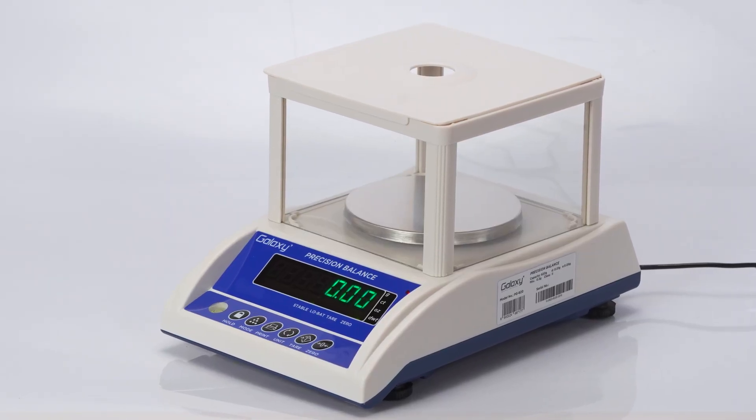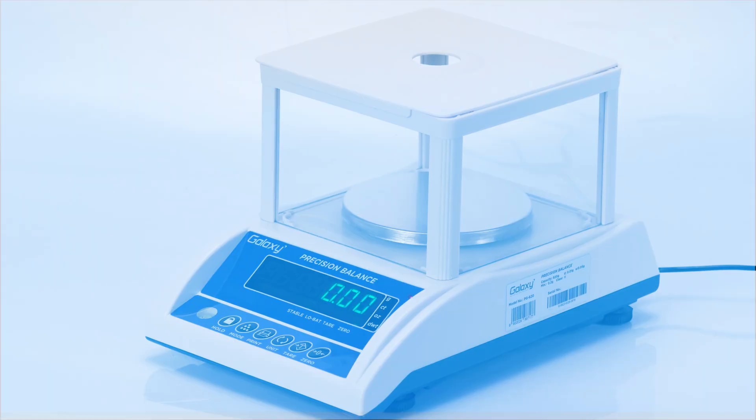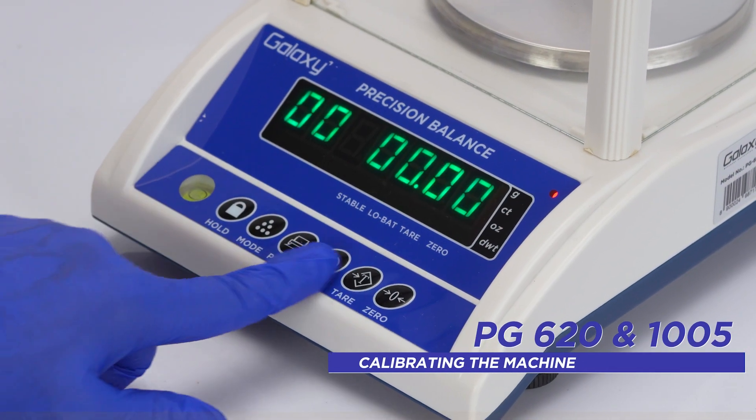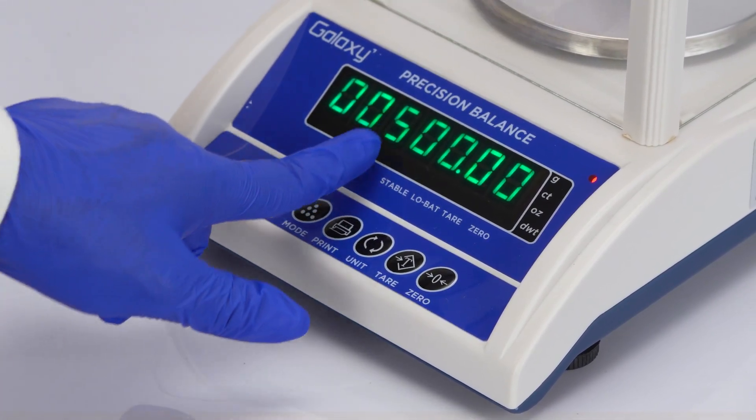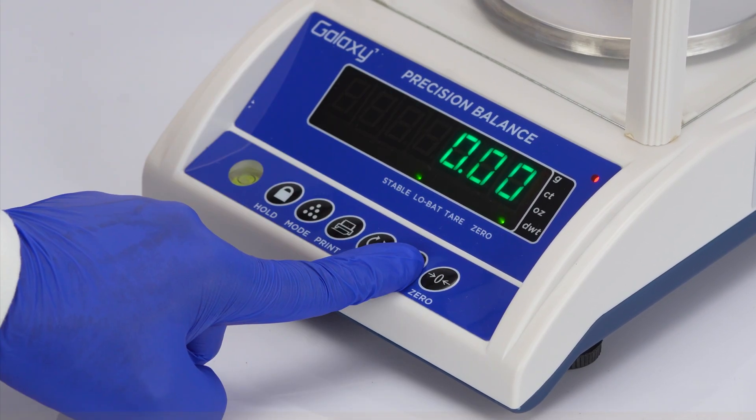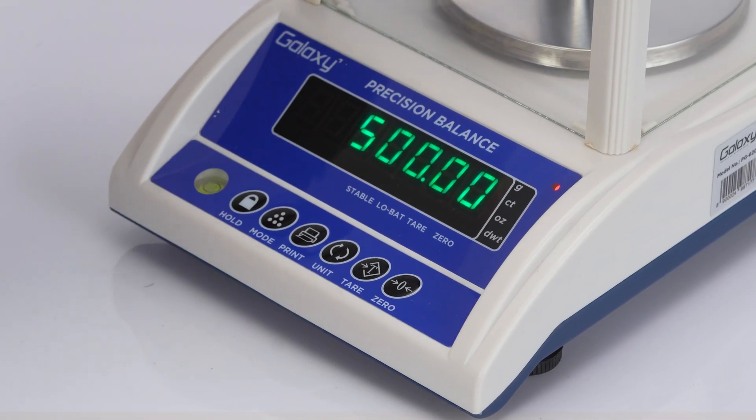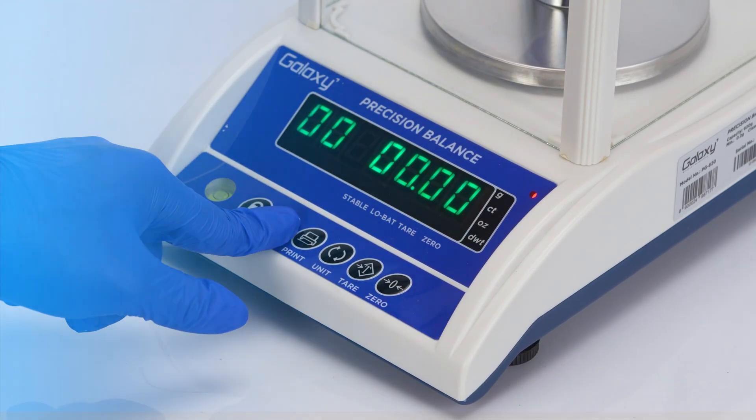Always calibrate the balance after setup or relocation to ensure accuracy. For calibration, press and hold tare in weighing mode until Cal appears. Adjust the displayed weight using tare, place the standard weight shown on the screen, wait for the stable symbol and press mode to complete the calibration.